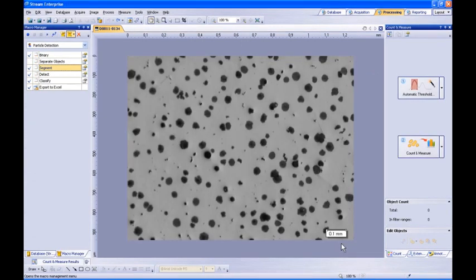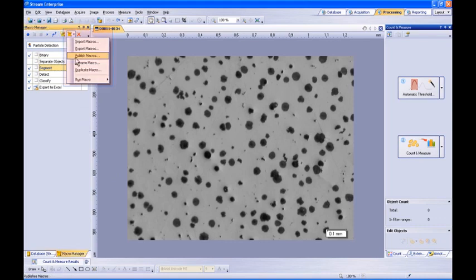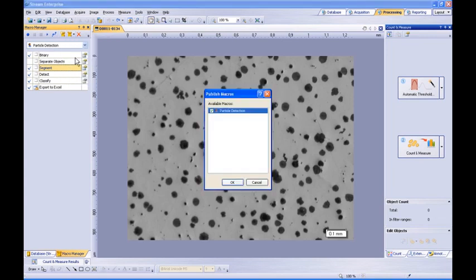However, the author can choose to publish their macro so that other users logged onto the same computer can access that macro. Click on the Macro Management drop-down menu, then select Publish Macros. Now, check the box for the particular macro or macros that you wish to publish, then click the OK button.